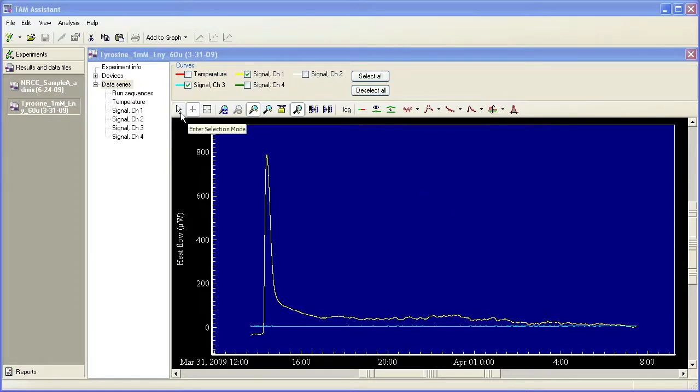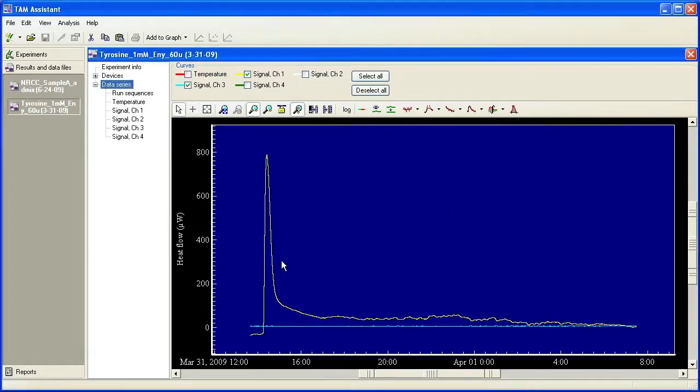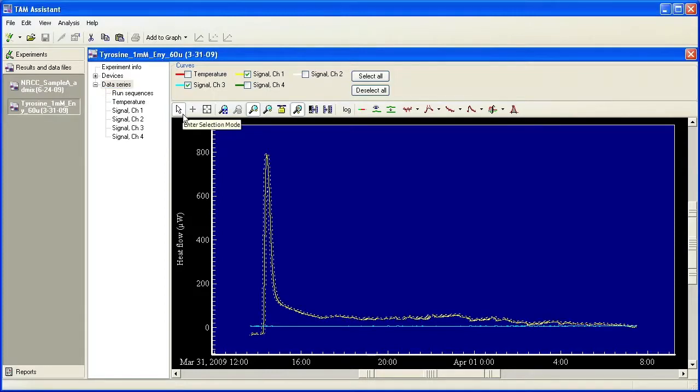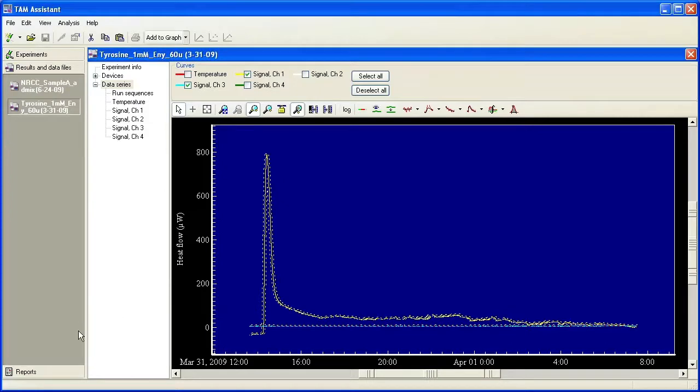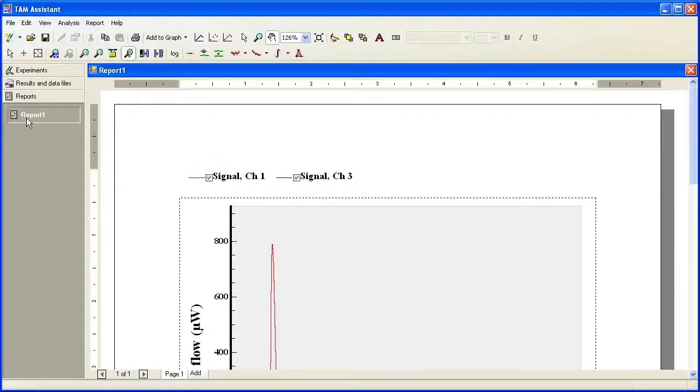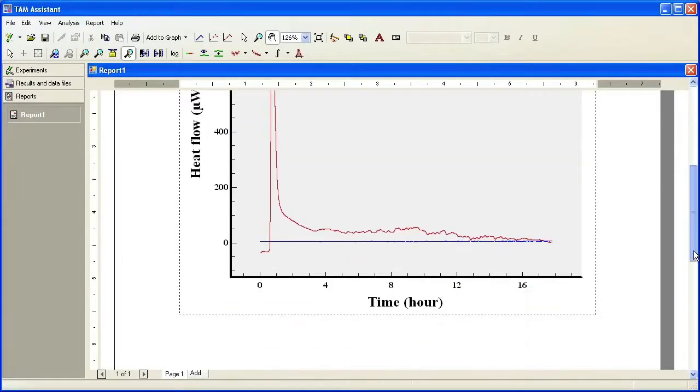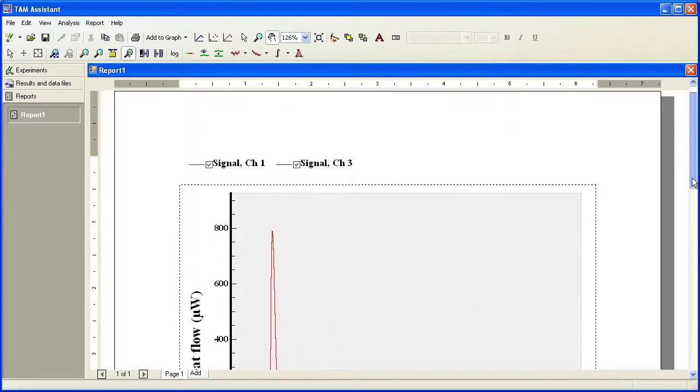So in order to create an overlay plot to save the data, enter selection mode and use your control button to select both curves. Come up here to the little triangle and say add to graph new report. You'll see a new report will be added, report one, under the reports tab here. Both files are available.